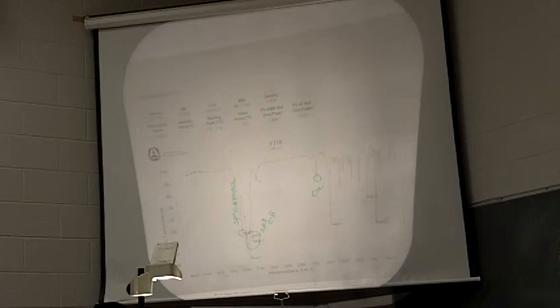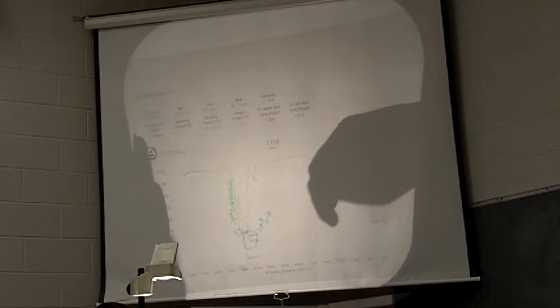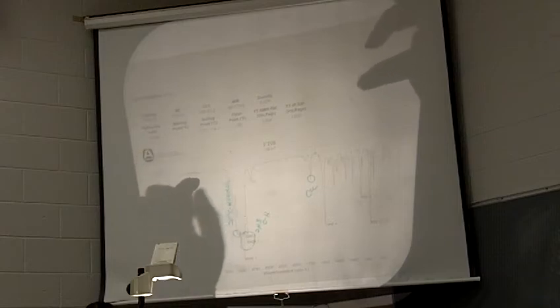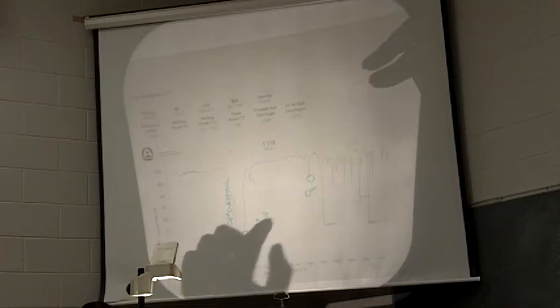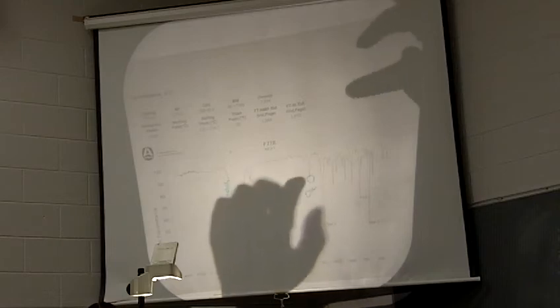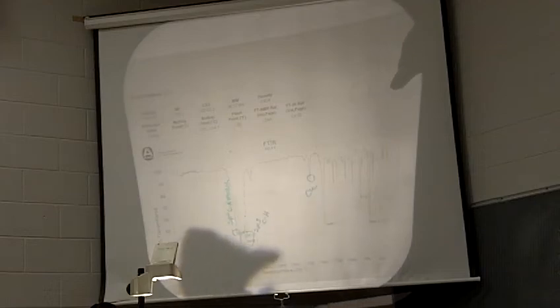What you're looking for when you're trying to characterize this information in terms of experiment 6. Okay, so you're looking again between 4,000 and almost 1350 basically. What type of peaks do you see? So we have cycloheptene here. It has a double bond, so we're going to see the sp2CH stretch. We're also going to see the sp3CH stretch, and we're going to see the C double bond C stretch around 1600. Those are the important things, and then we've got some CH bending here as well that we would identify. All right. So those are the type of things that you're going to look for.